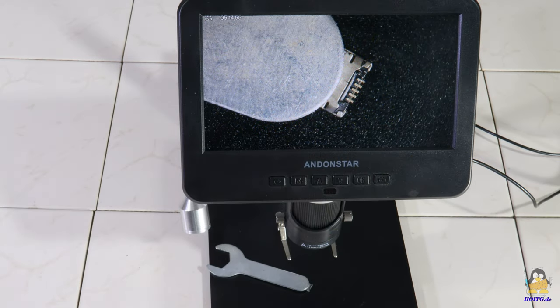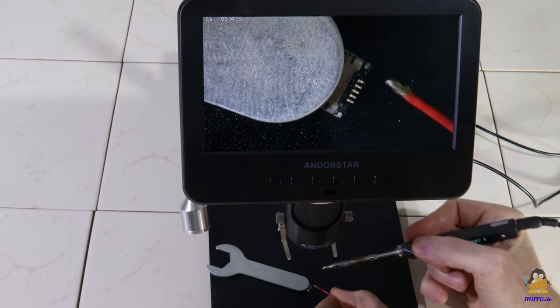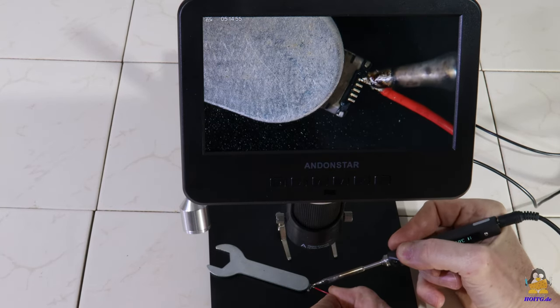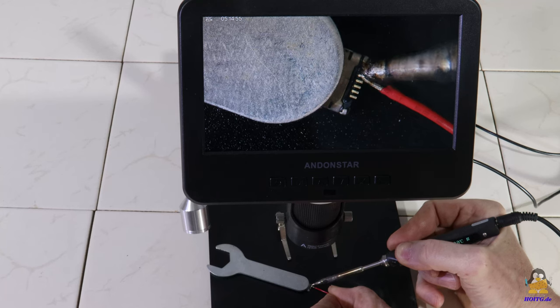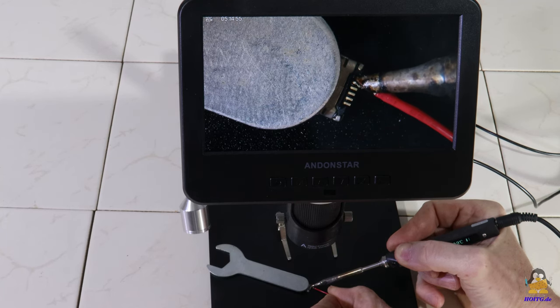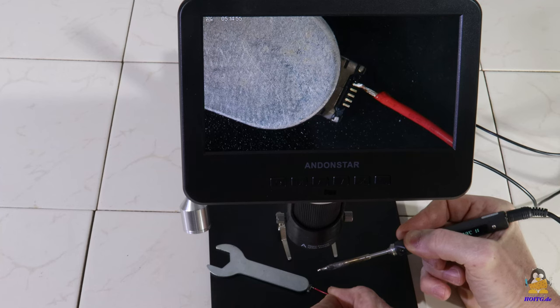A large distance simplifies working on the object being observed. The smaller the objects, the better a higher magnification factor and this is what lens number 2 is good for.